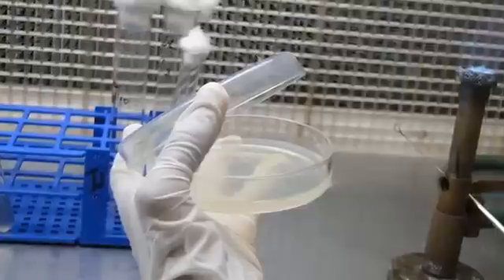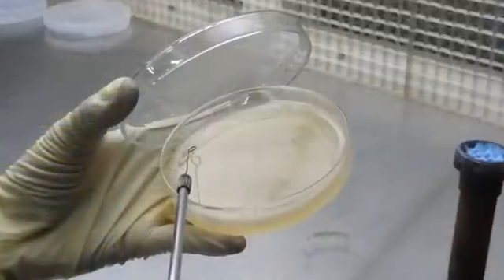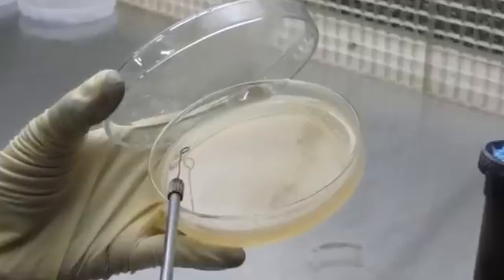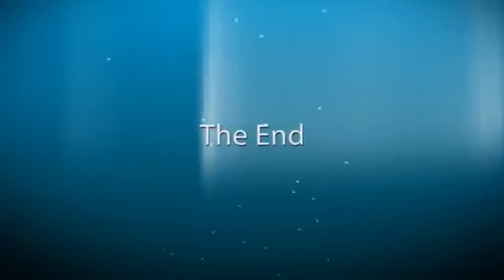Keep the plate covered as much as possible to avoid contamination. While streaking a section of the plate, try to keep the inoculating loop in contact with the surface of the agar at all times.